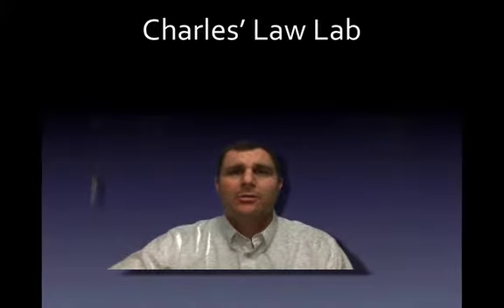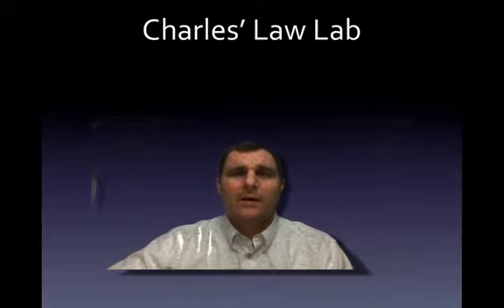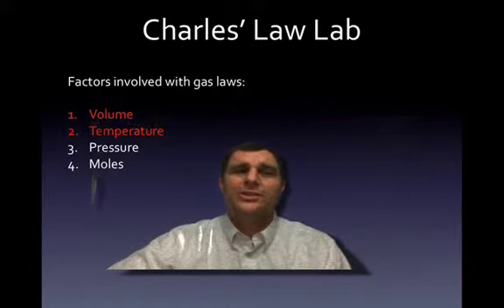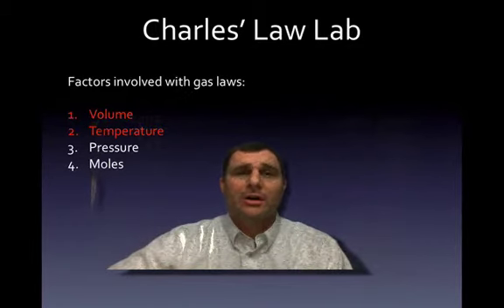Hey guys, today we're going to be going over Charles Law Lab. And Charles Law Lab falls into our gas law unit. Now, when we talk about gas laws, you're going to remember there are four variables that we talk about with gas laws. We're talking about volume, temperature, pressure, and moles. And Charles Law specifically deals with the relationship between volume and temperature. This lab is going to deal specifically with how we change the temperature and that affects volume.